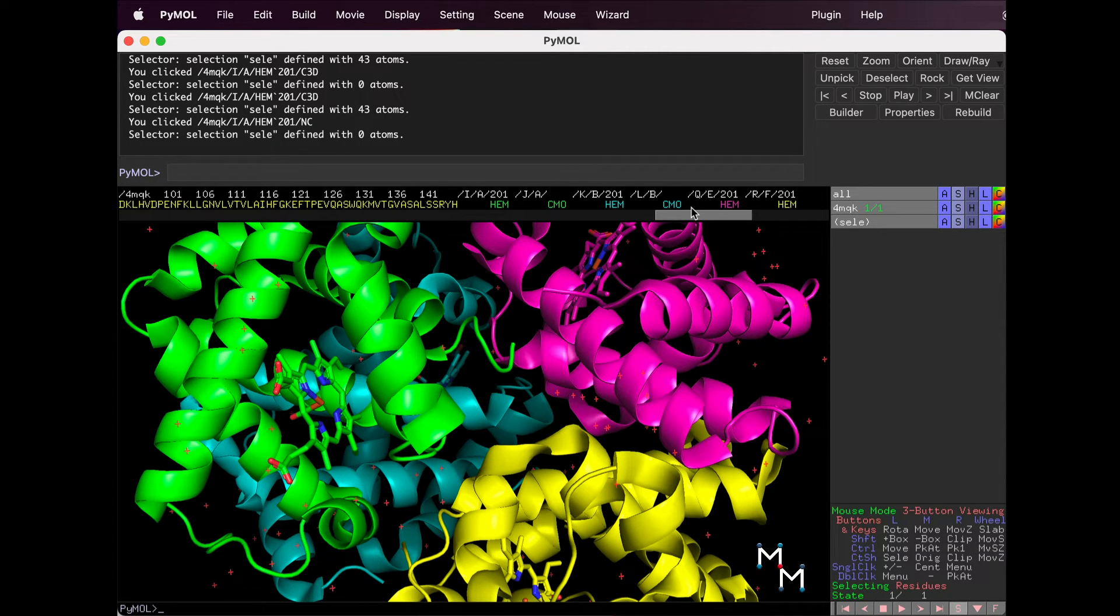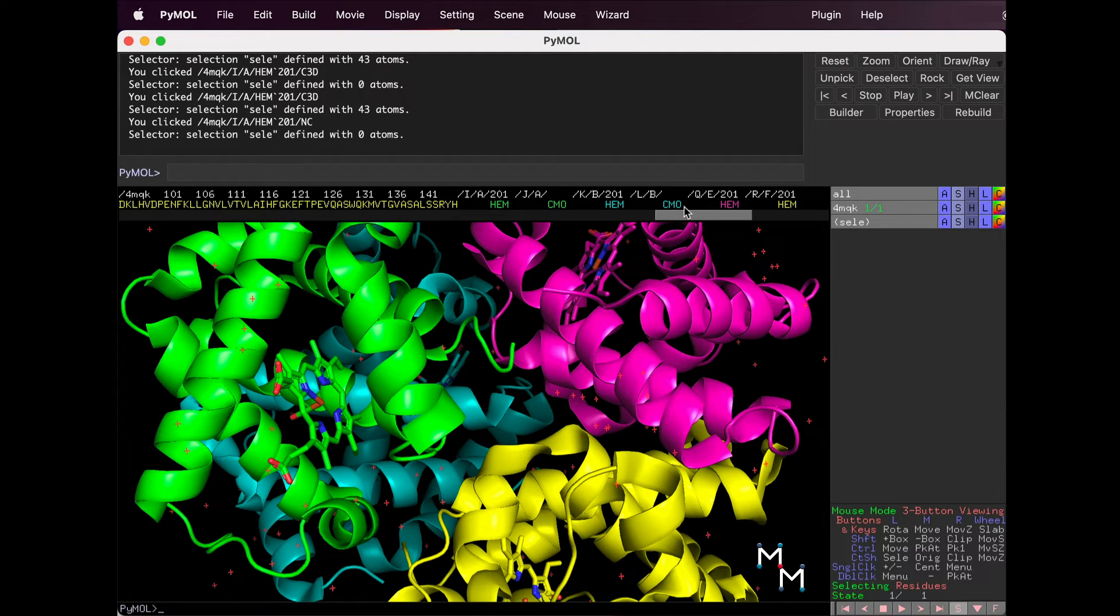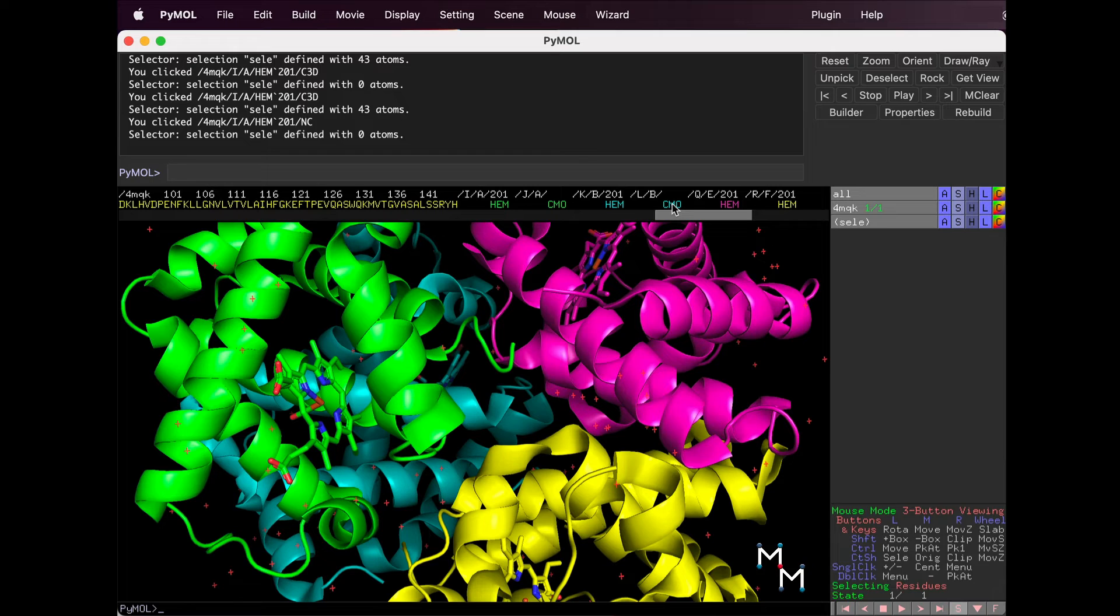These are carbon monoxide molecules bound to the oxygen binding site. They're smaller, so they're hard to see. Let's use Pymol to focus in on one. Click on a CMO in the sequence.